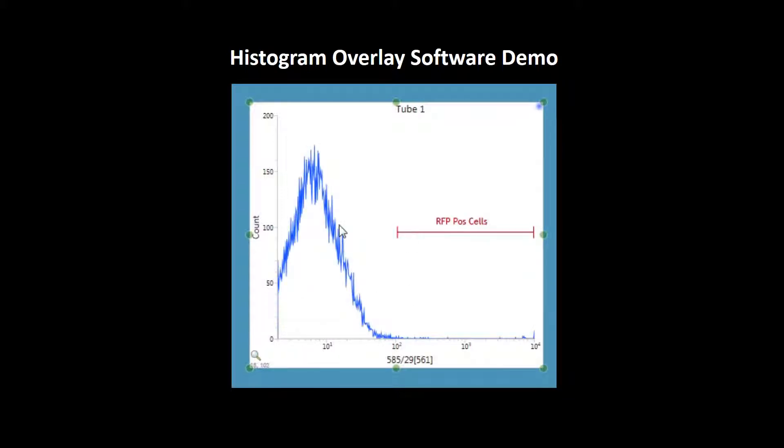What I am going to do is overlay the RFP positive histogram on this plot. You can see the histogram plot, this red region, and this is my RFP positive cells. This is the histogram overlay plot which you can use to show your fluorescence shift and for other purposes also. Thank you.